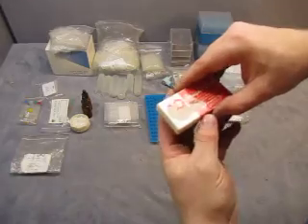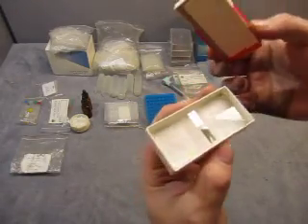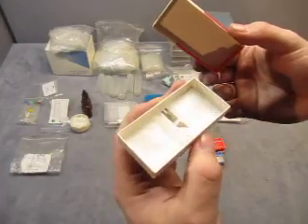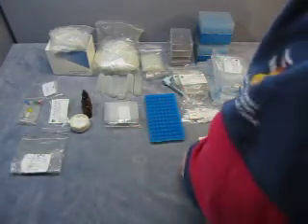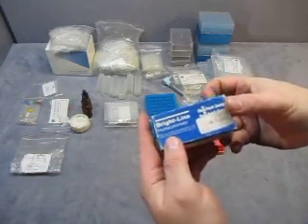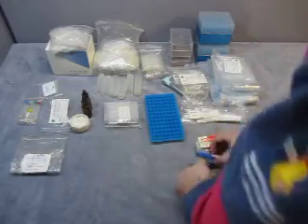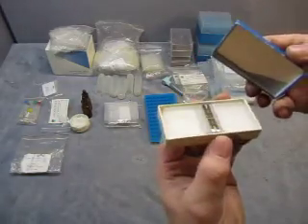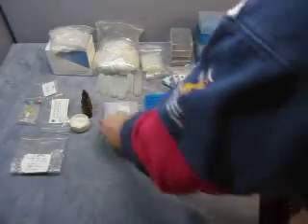Then you get some slides — these are hemocytometers, made by American Optical. You get three of those. Then you get some other ones that are blue — maybe a little thicker or something. Five hemocytometer slides in total.